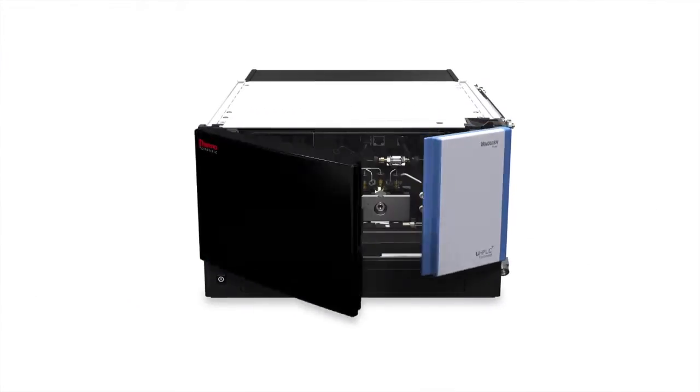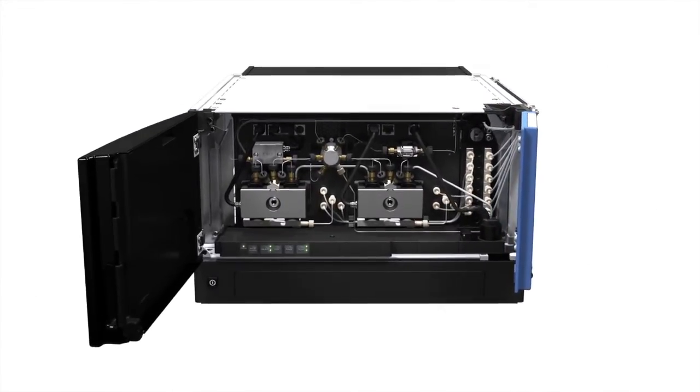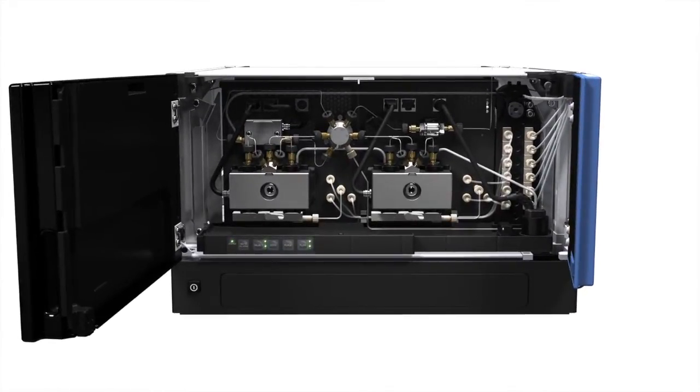Driving the separation is the Vanquish pump, delivering a pump pressure of 1500 bar, that's 22,000 psi, without compromising durability and robustness. It can deliver flow rates up to 5 milliliters per minute and has the availability of two 3-solvent channels for method development flexibility.